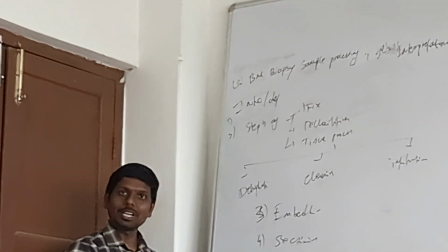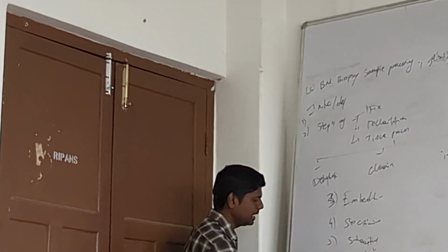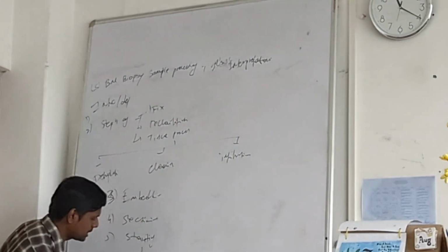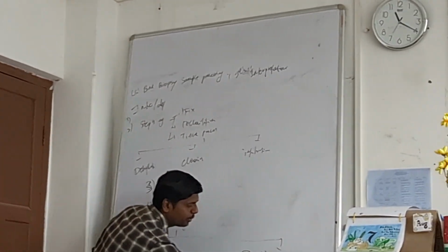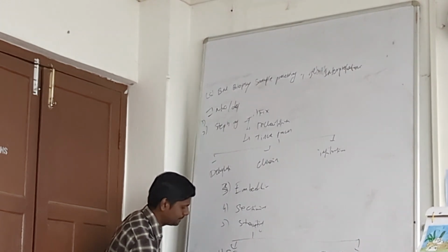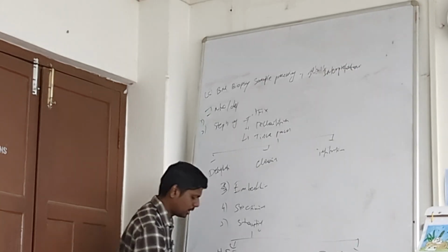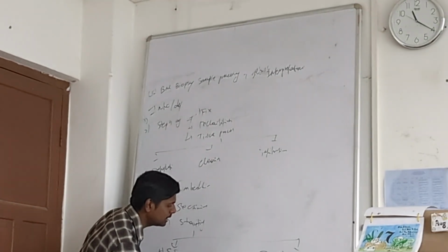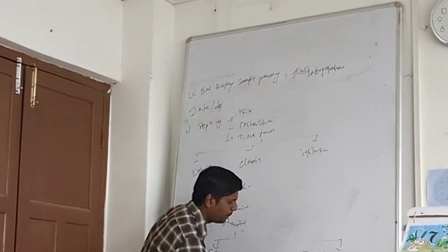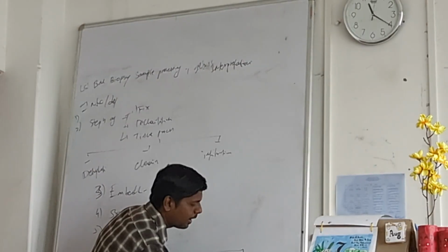Don't mind my writing, okay? I want to finish the lecture quickly. Anyway, in staining we have two main things: H and E staining and special stains. In the case of special stains, we are going to focus on 4 or 5 important ones that include reticulin stain, Masson's trichrome stain, periodic acid Schiff stain, Giemsa and iron stain.